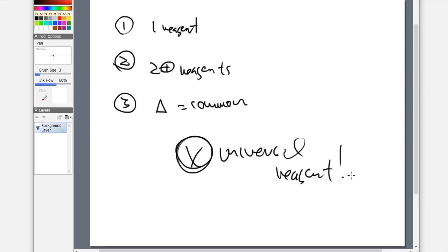Derivatization is not a have to. This is not a must. You do not have to do it, but you can do it as an option to get what you're looking for to show up much better on a plate that will allow your visualization to take place smoother, it's more obvious, and the calculations you feel better about because you can see those images much clearer than if you did not derivatize in the first place. So you'll see with us that some of the methods that we'll do will require derivatization, some will not.